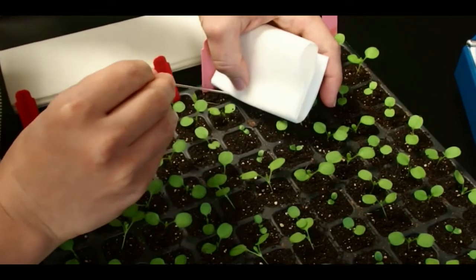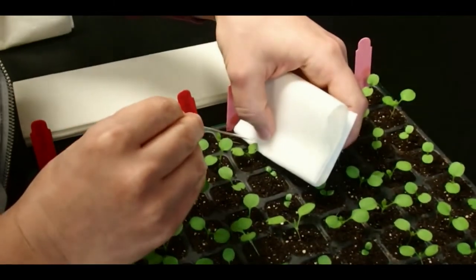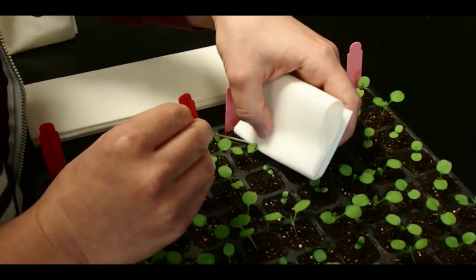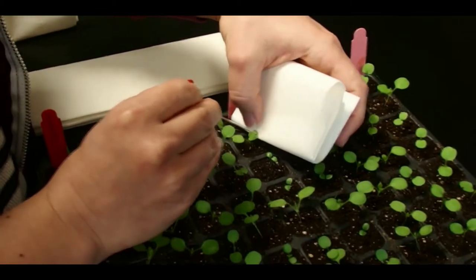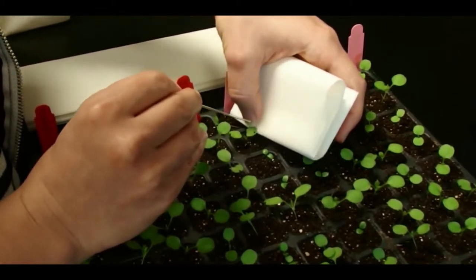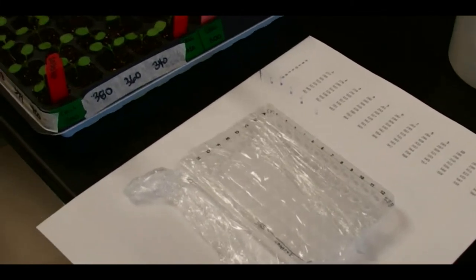So that one, I lost the disc, so I'm just going to redo it. Yeah, it's important to actually have a disc that you transfer. It's desirable not to damage the plants too much, but we need to get something that we can get DNA from. Sometimes the discs get stuck to the paper towel and then fall off.